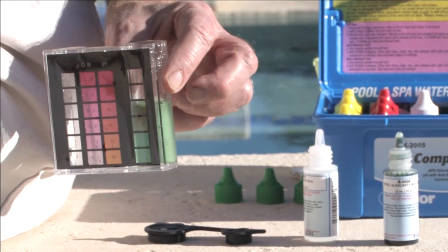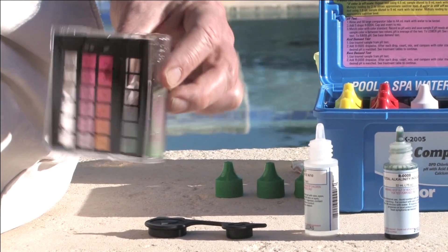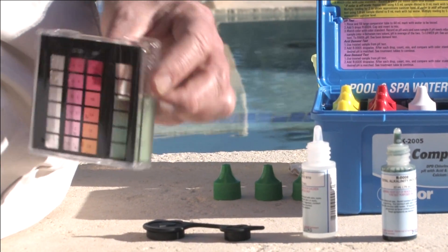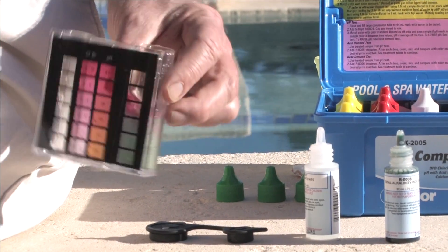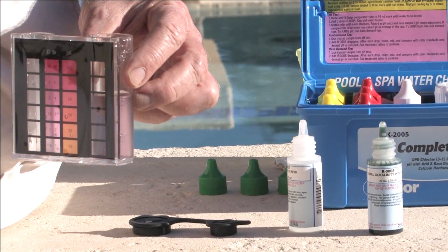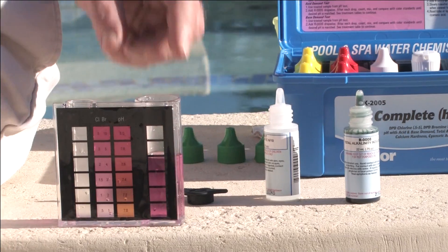4 drops, 5, 6, 7, 8, 9, 10, 11, 12, 13. We're getting close. 14, 15, and 16. 16 drops. And we have a red color.